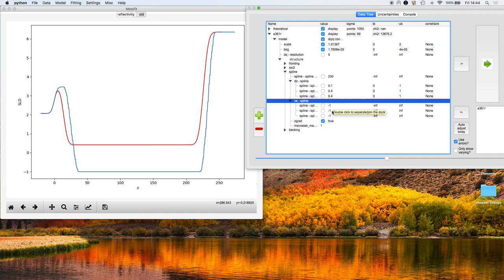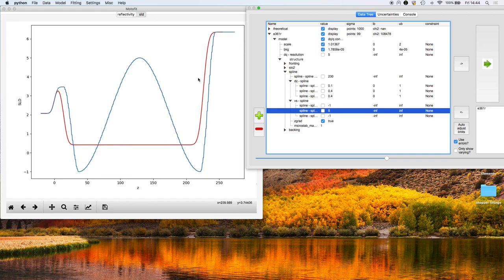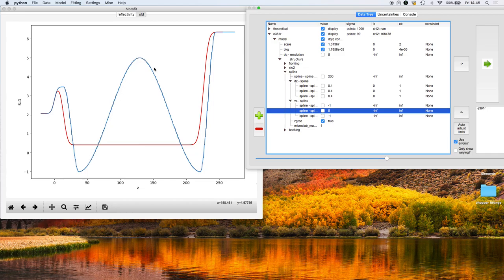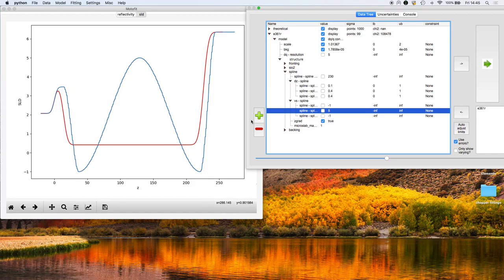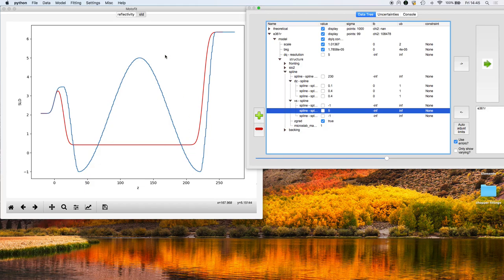These Vs specify the scattering length densities at each of the knot points. At the moment they're all set to minus 1. If I change this one to 5, you see the spline creates a free-form model that goes something like a sine wave. By using different numbers of knots—going from 1 to 2 to 3 to 4 to 5—you can build in increasing flexibility within this region and describe it with a free-form profile.